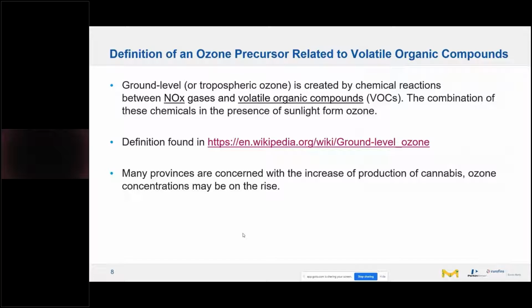Like I said, PerkinElmer developed this method, and if you're in a state that is in non-attainment or exceeds its allowable ozone precursor compounds, you'll notice when you go to the gasoline pump, there's a recovery of the volatiles on the pump, and that was mandated by this act. So it's very important for health.